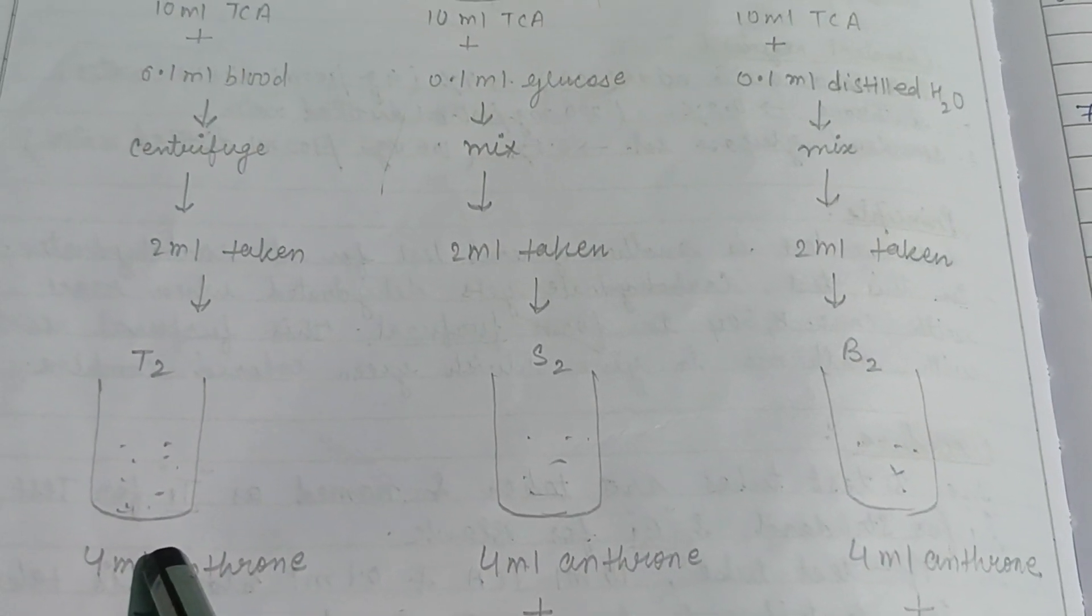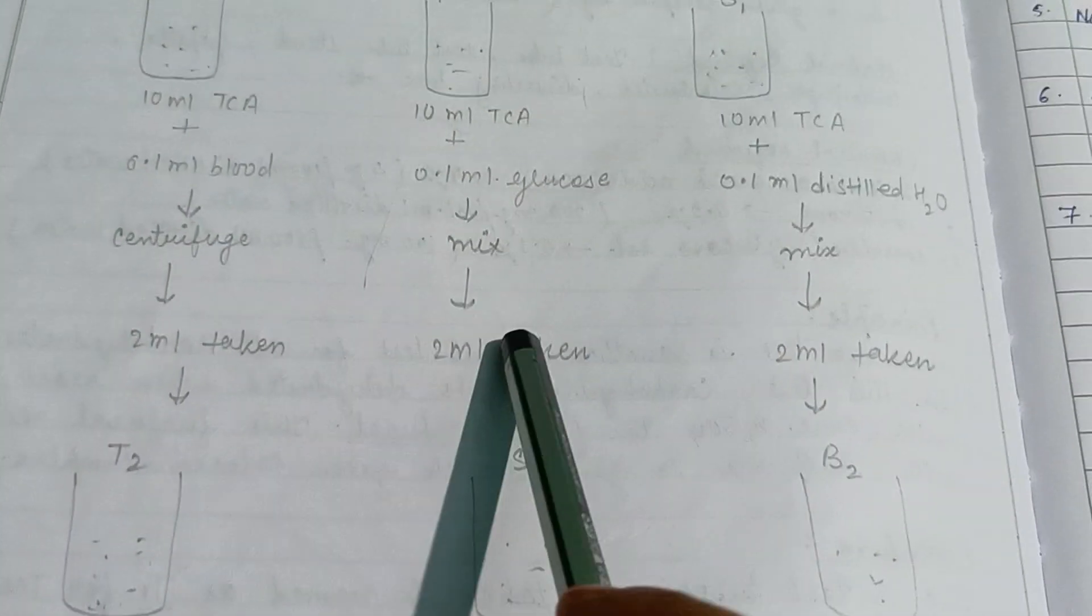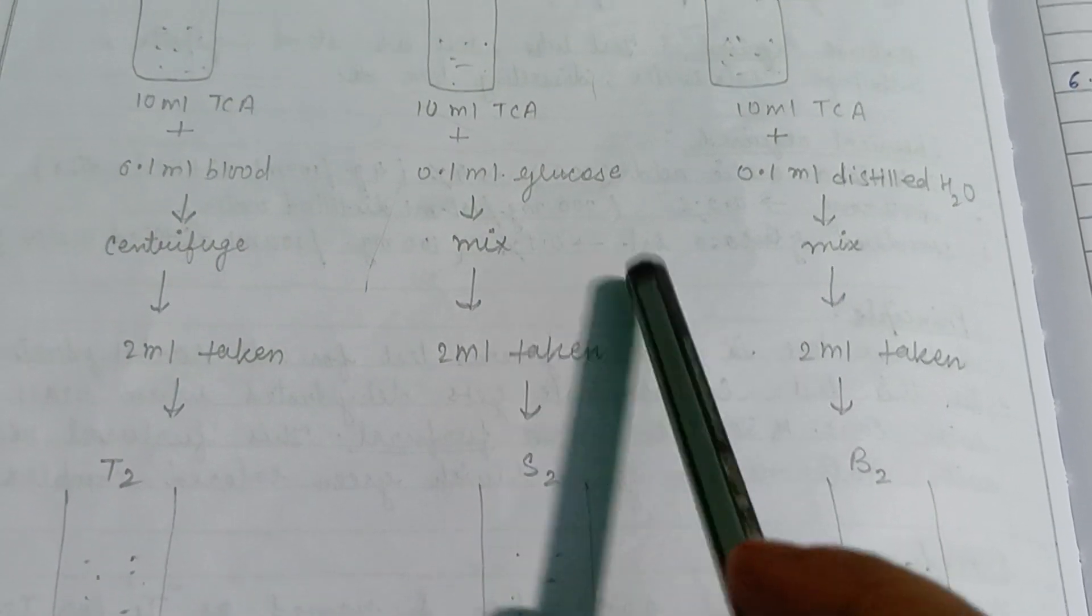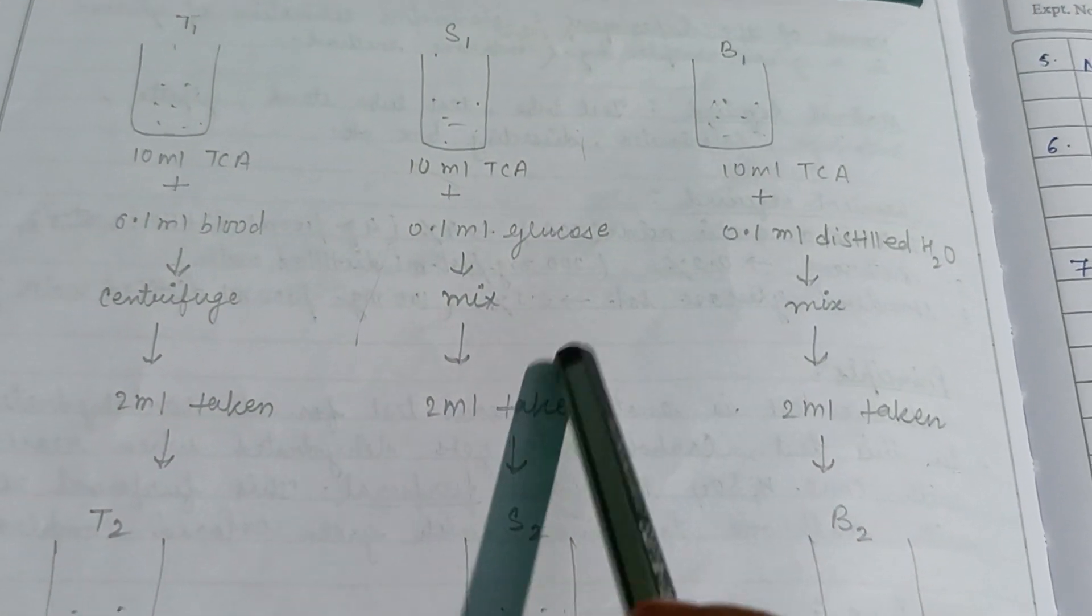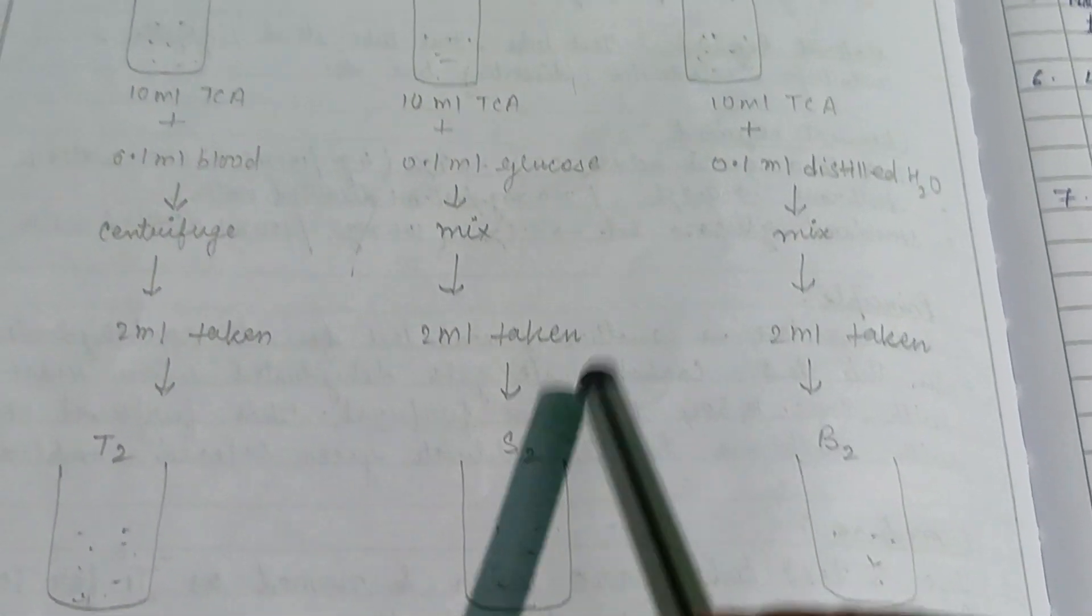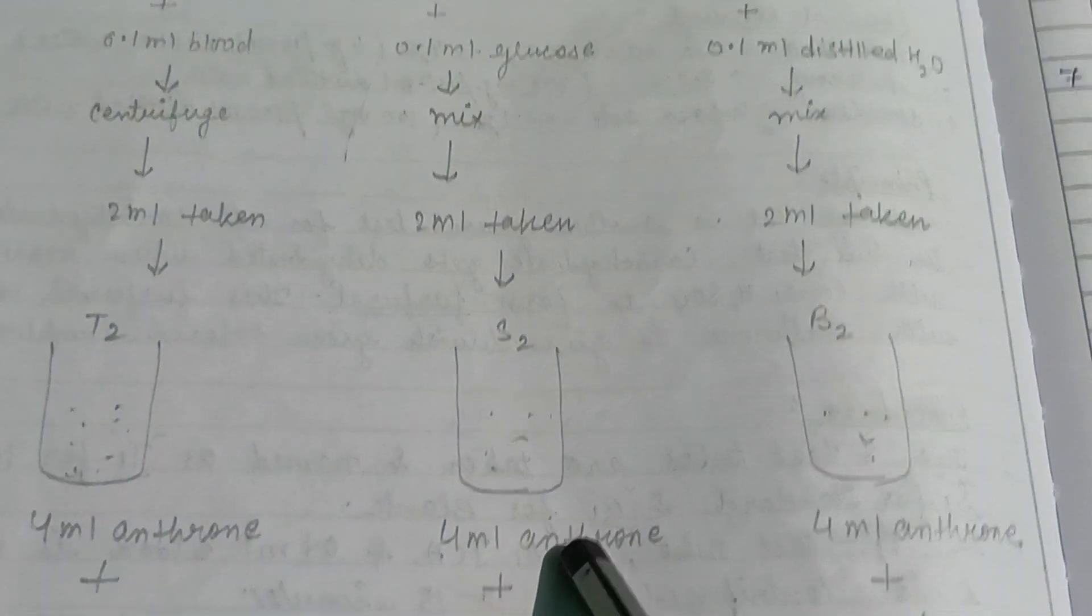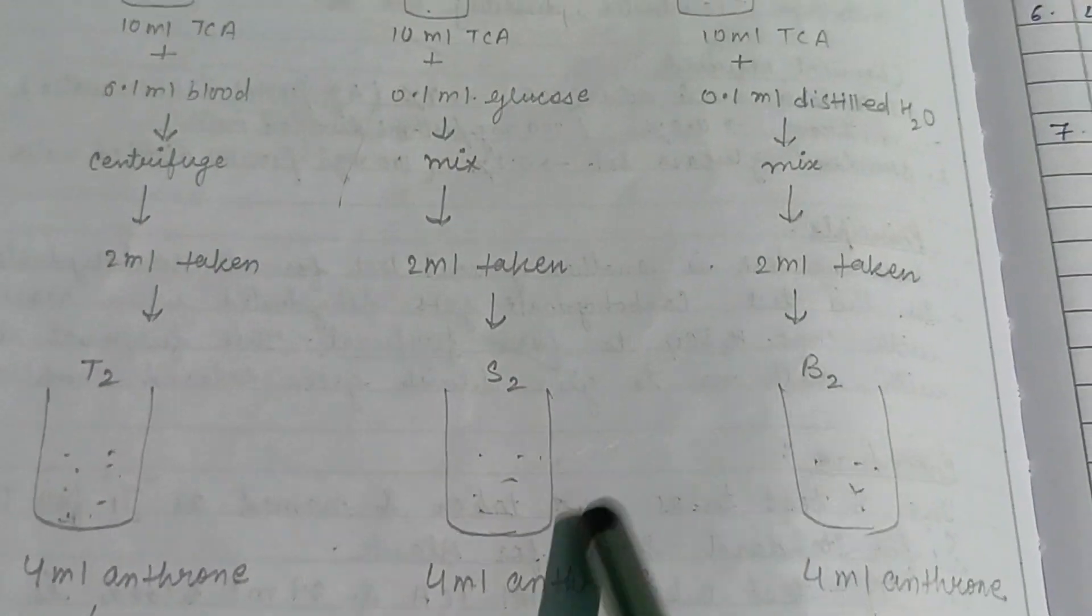0.1 ml glucose is added in S1, then it is mixed thoroughly. 2 ml of S1 is taken in another test tube named as S2. Similarly, in test tube B1, 0.1 ml distilled water is added.